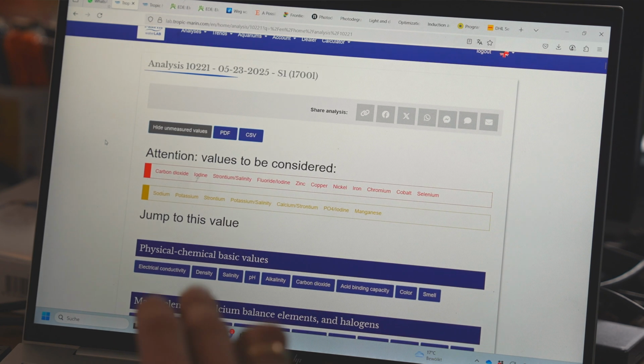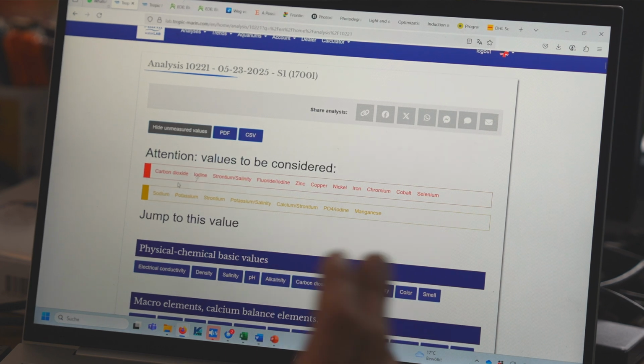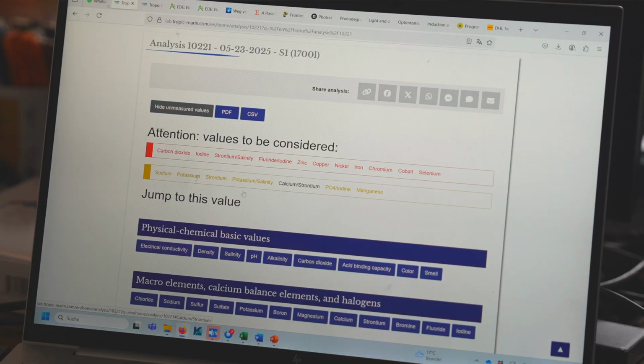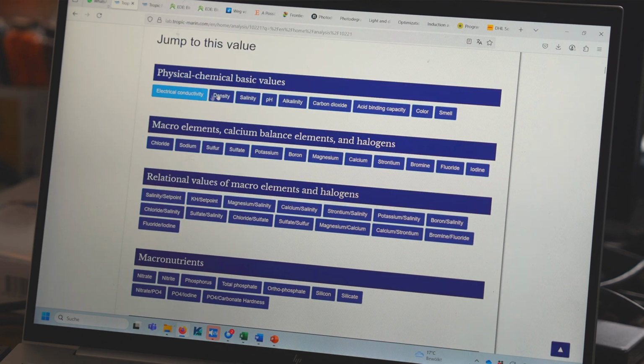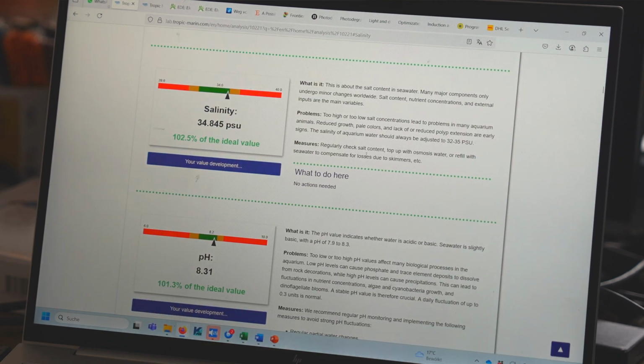So already in the beginning, you get a notification, attention, these values should be considered. So the concentrations of these elements you should take a look at, because they could either be problematic or become problematic. And then there's certain elements that are a little bit outside the recommended range that you should keep an eye on, but it's nothing to freak out about, basically. Different categories, if you click on it, you can just jump to, basically. Here's salinity, for instance, and here on the website you always get a color code.